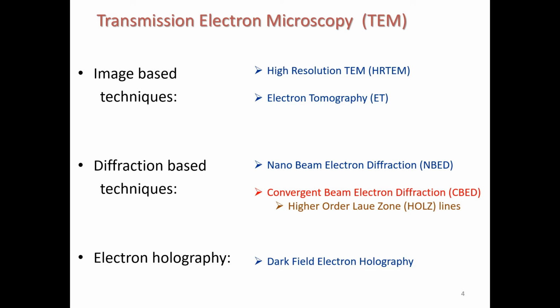In this work, I combined convergent beam electron diffraction technique with the electron holography to directly and experimentally reconstruct the phase across the split HOLZ line. This carries the z-dependent atomic displacement profile, the missing dimension profile.